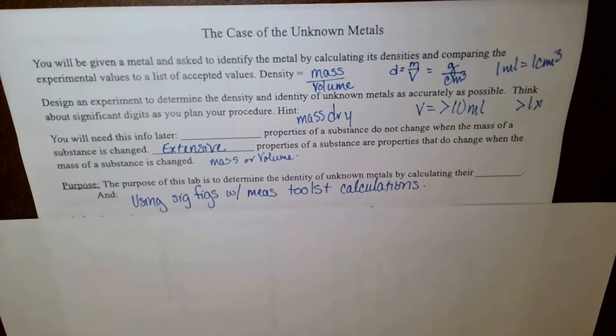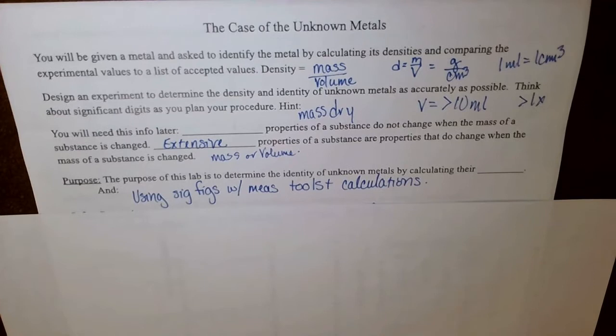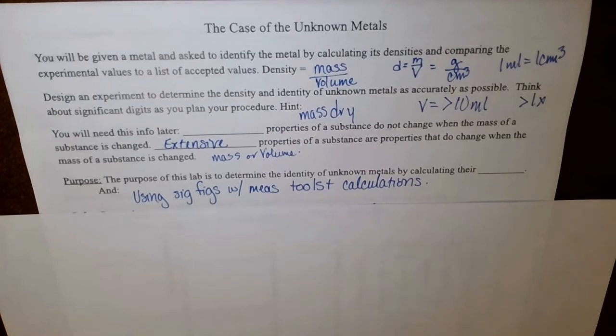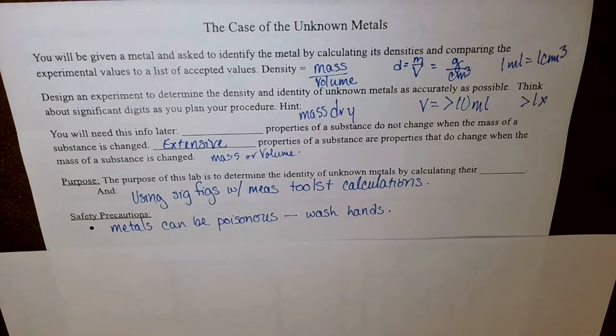So the purpose of this lab is to determine the identity of the unknown metals by calculating their density. And the real goal here is to practice using significant figures with measurement tools and using significant figures when you're doing your calculations.